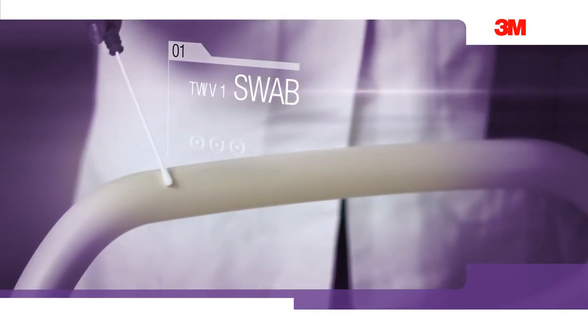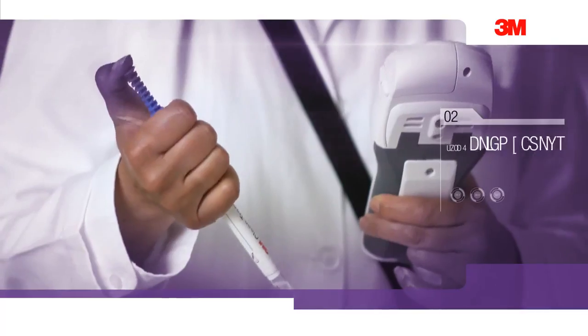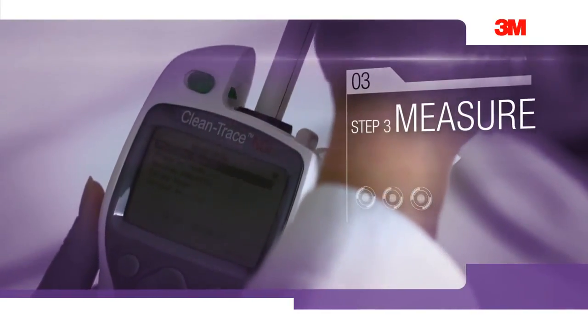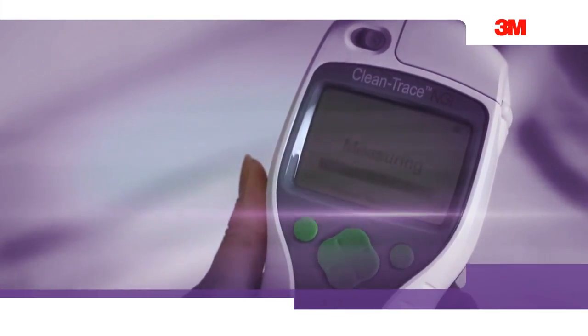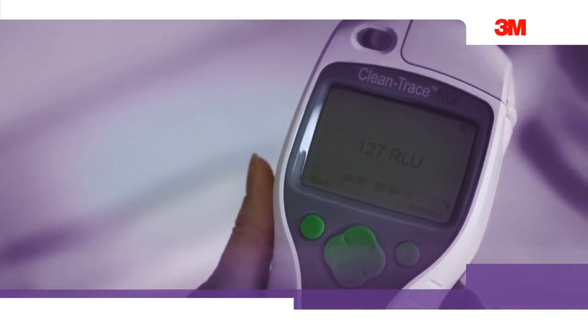Begin by sampling the surface using the 3M Clean-Trace ATP surface test. Activate the test and shake for 5 seconds. Place the swab in the chamber of the 3M Clean-Trace NGI luminometer. Within 30 seconds, the Clean-Trace luminometer will display a measure of cleanliness expressed in relative light units, or RLUs.